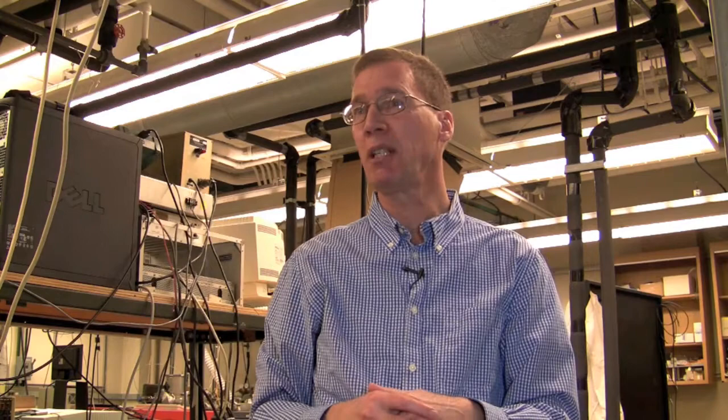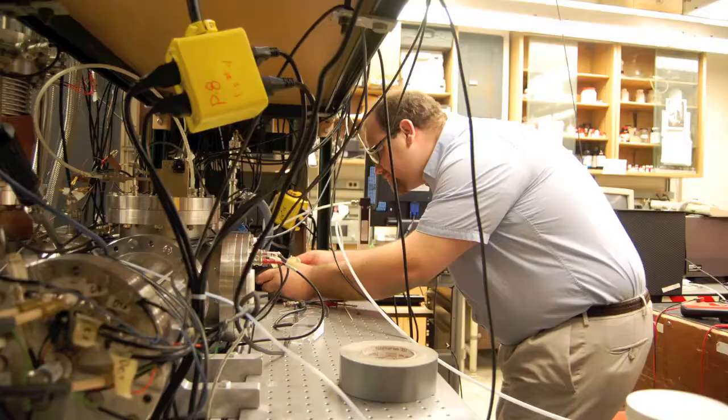On that level, they've also been extremely helpful. And then all the wiring and electronics, more generally, for putting together a complicated instrument like this, they've helped us in decisions on, for instance, you can't just hook a wire to something that's at 5 Kelvin in the normal way, because that's at such a low temperature, and the other end of the wire being at room temperature, you just can't do that. You'll just be spoiling the cold temperature. You need to do a multi-stage process of taking even the wires from room temperature and bringing them down to these extremely cold temperatures. They've helped us with the choice of materials and are actually doing the soldering with special solders and all kinds of things like that that go into building a unique instrument like this.